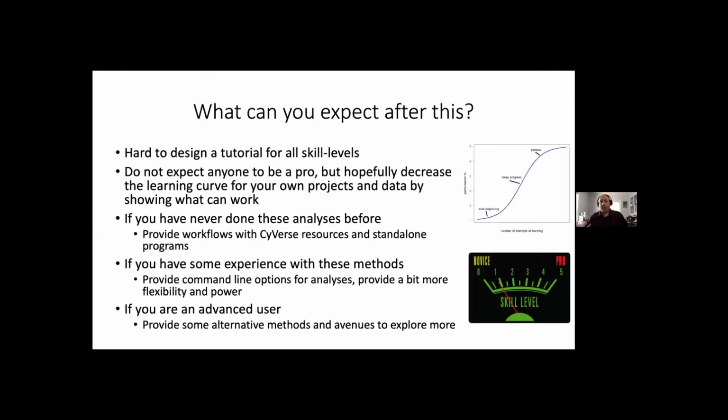So what can you expect after this? As I sat down to try to create this webinar and go through the tutorial, I realized that it's very hard to do this to encompass all skill levels. So when this is all said and done, I do not expect anyone to be a pro at any of this. But my main hope is to decrease the learning curve for your own projects.